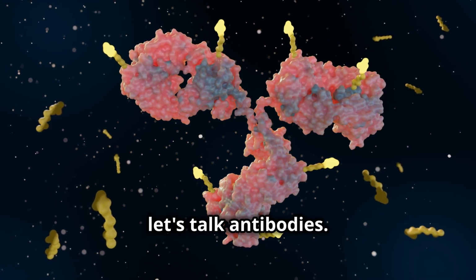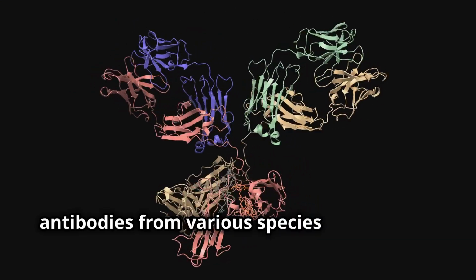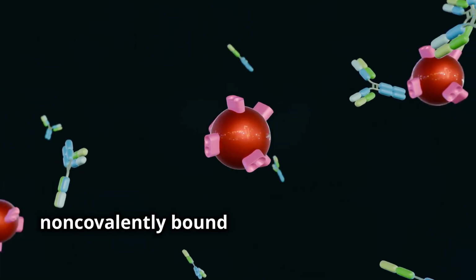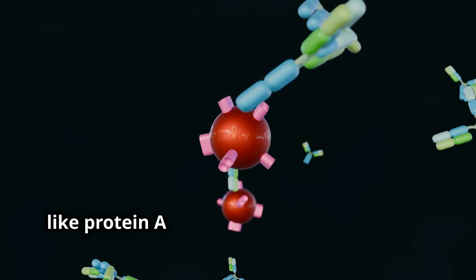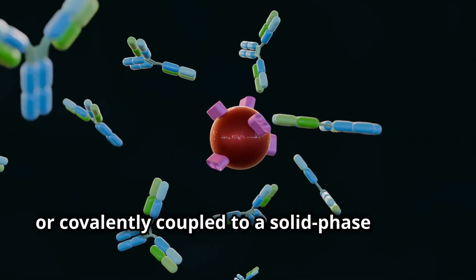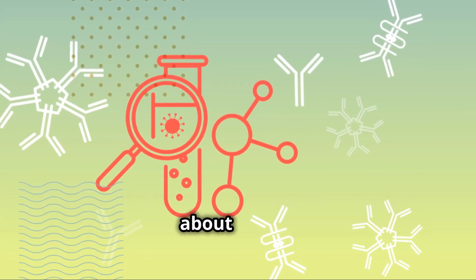Now, let's talk antibodies. Both monoclonal and polyclonal antibodies from various species can be used. These antibodies can either be non-covalently bound to immunoadsorbents like protein A or protein G magnetic beads, or covalently coupled to a solid phase matrix. There are several types of immunoprecipitation techniques to know about.